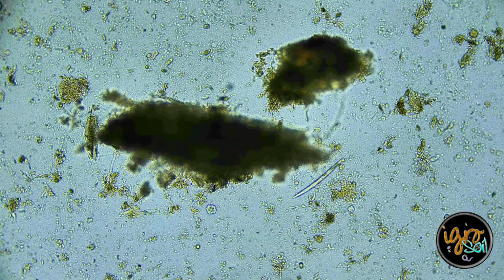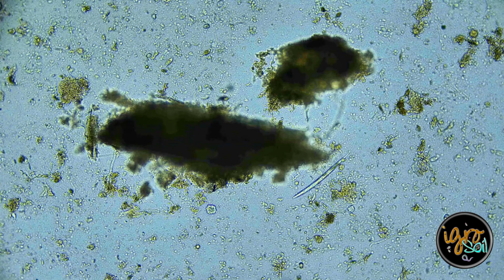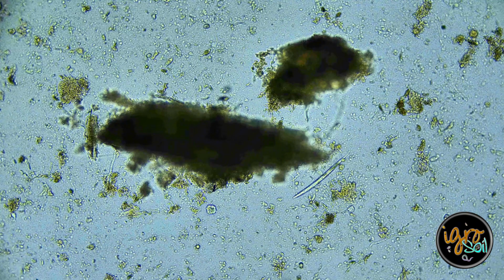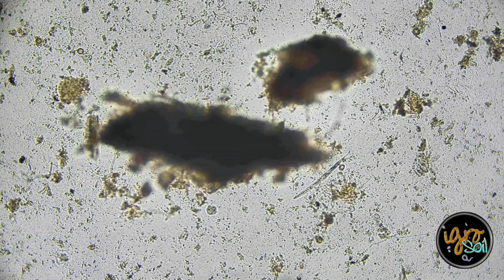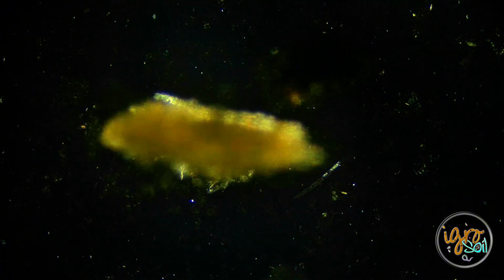Another nematode. Anyway, there's one more thing I want to do, and I'm going to put this polarized film on this and see what type of colors I get, which usually in mushrooms is a lot just because of their secondary metabolites and what they process and the minerals, and they're mineral rich. Look at that. All of a sudden everything changes, right? Even what's inside of that nematode. And just to point it out again, that's the nematode.